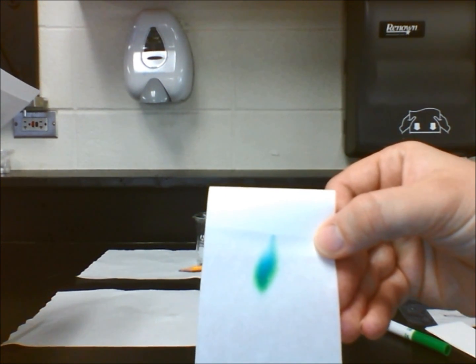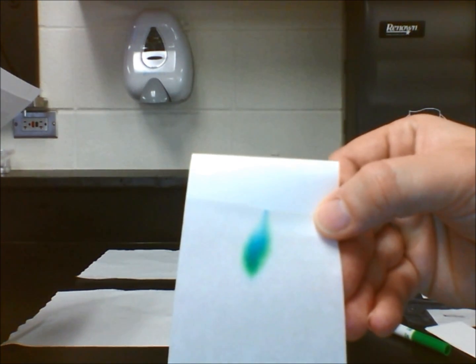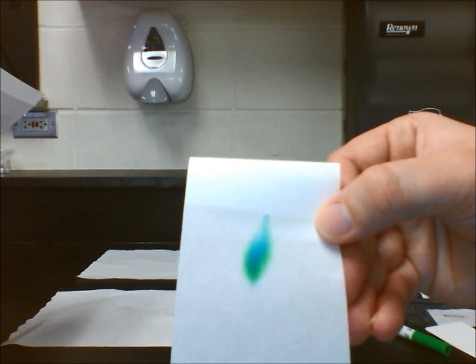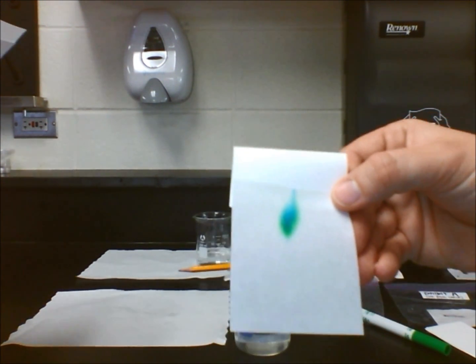The solutes that make up the green ink are being separated by the water passing through the chromatography paper. We can therefore conclude that the green marker is made up of two different solutes, blue and yellow.